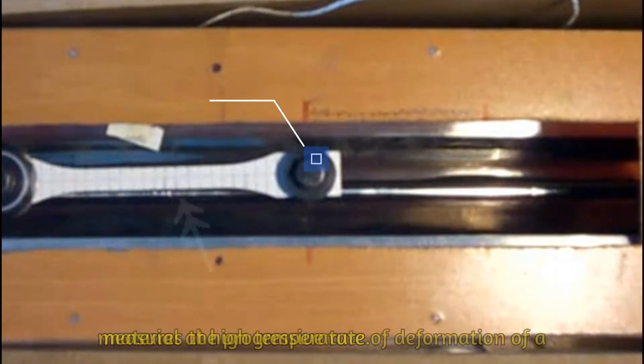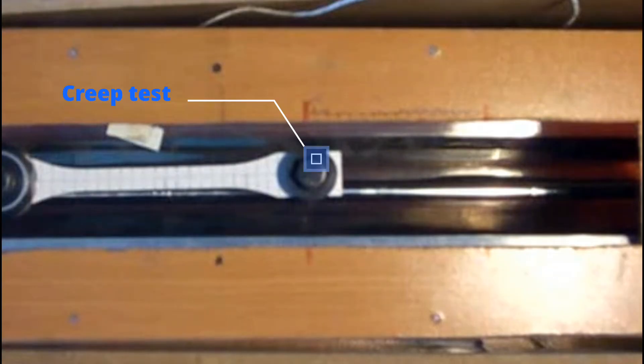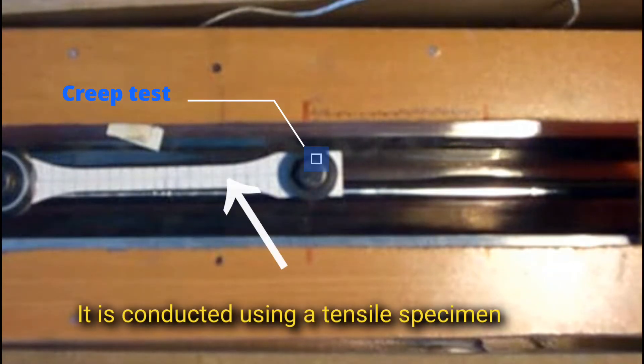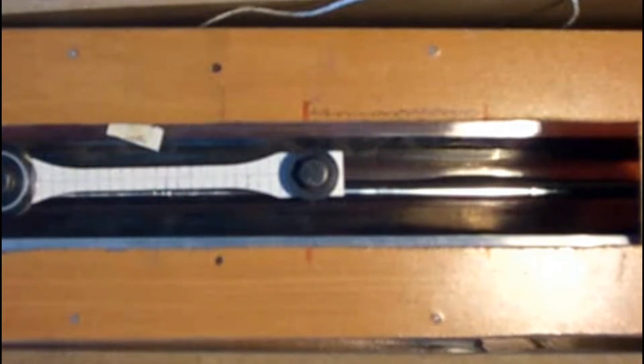A creep test measures the progressive rate of deformation of a material at high temperature. It is conducted using a tensile specimen to which a constant stress is applied at a constant temperature, often by the simple method of suspending weight from it.